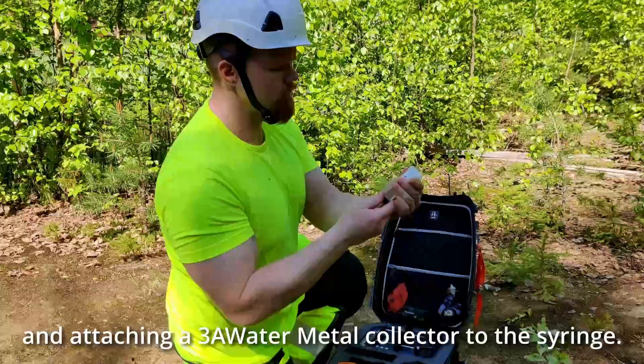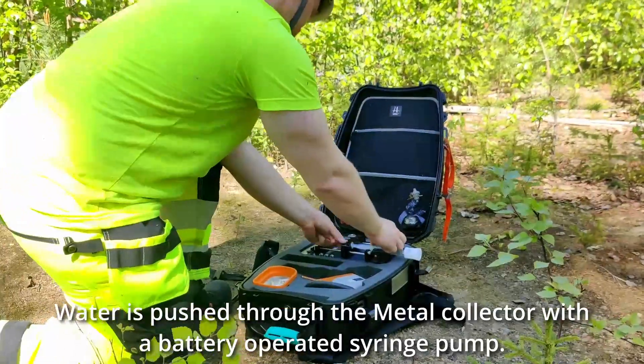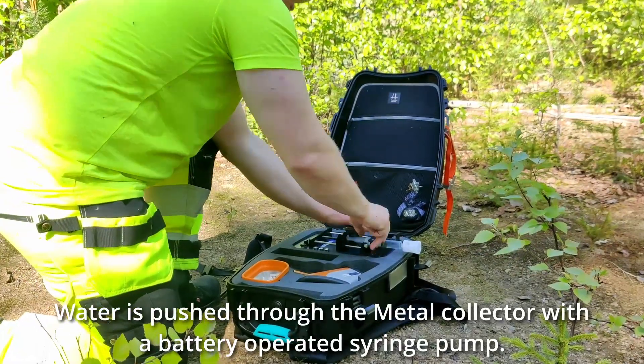Attaching a 3A Water Metal Collector. Water is pushed through the metal collector with a battery operated syringe pump.